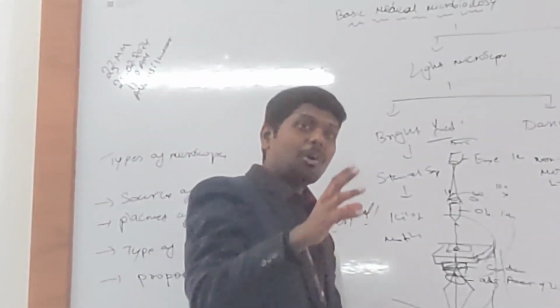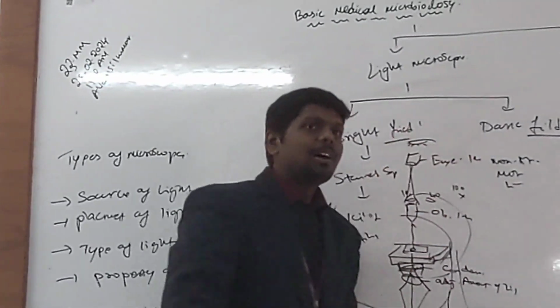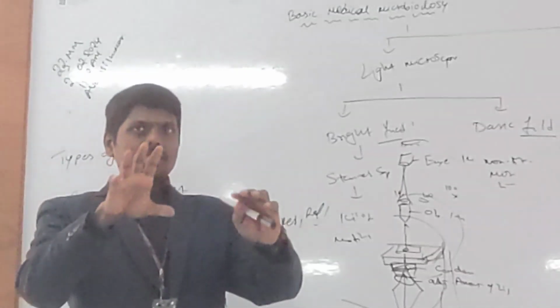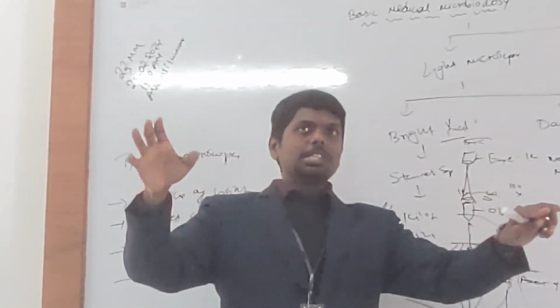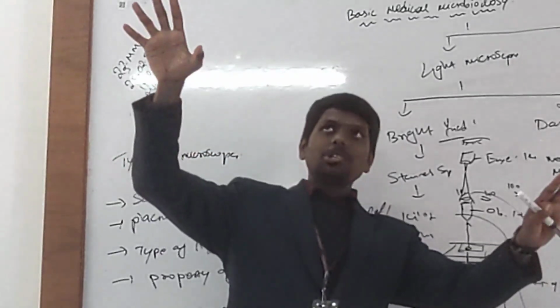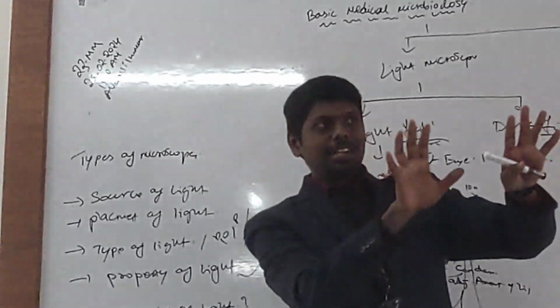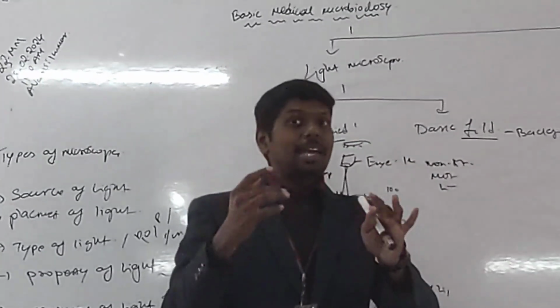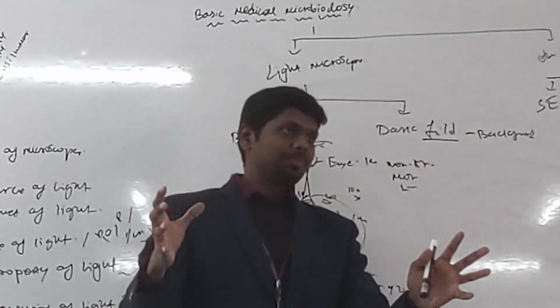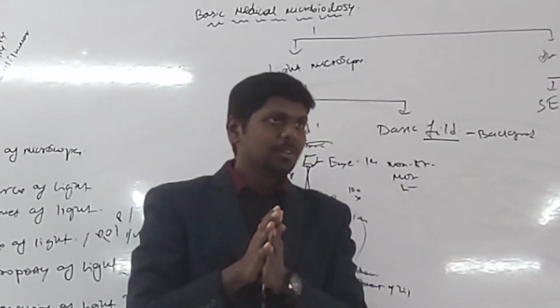Yeah, it is possible. What we did is, if I keep a dark background, imagine you have some glass sheets, glass doors, okay? And this room is dark. We switch off the lights in the room. So some of the light from outside will hit the glass, and I can see the glass in a dark room. But I cannot see a glass in a bright room, because light passing everywhere and it looks very transparent.